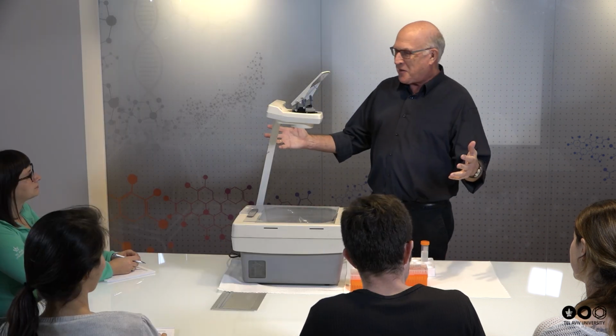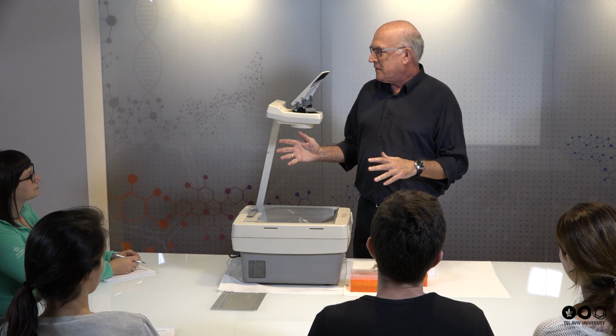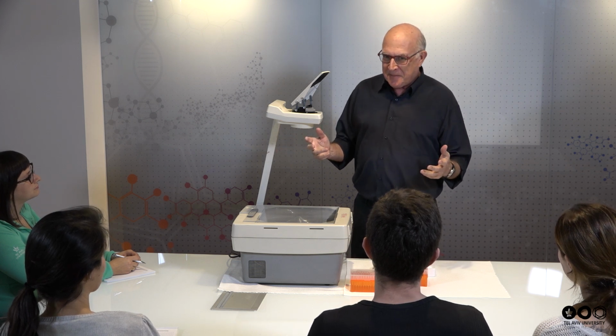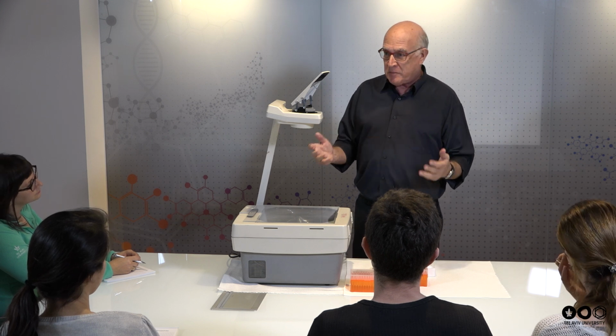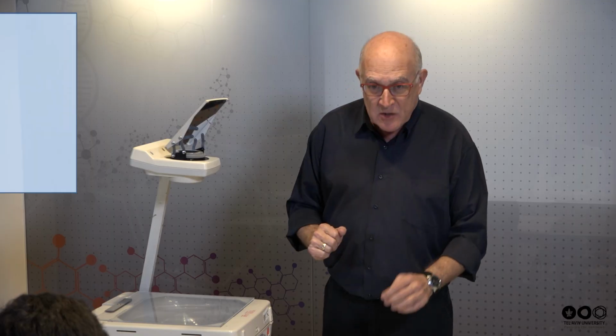Hi, so welcome to the mini class. Today we're going to talk about hydrophobicity and hydrophilicity. We talked about water and how it interacts via hydrogen bonding, but now we're going to see it with our own eyes. We have three reagents.